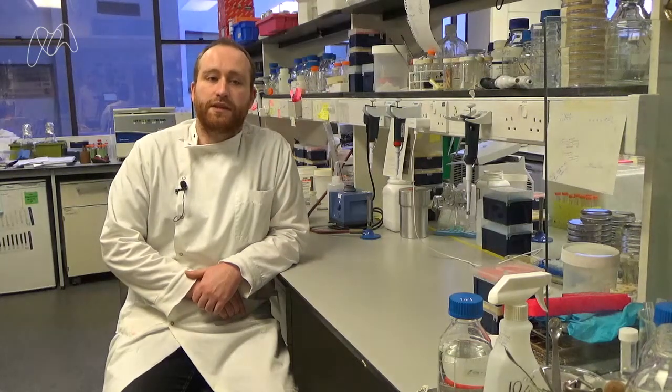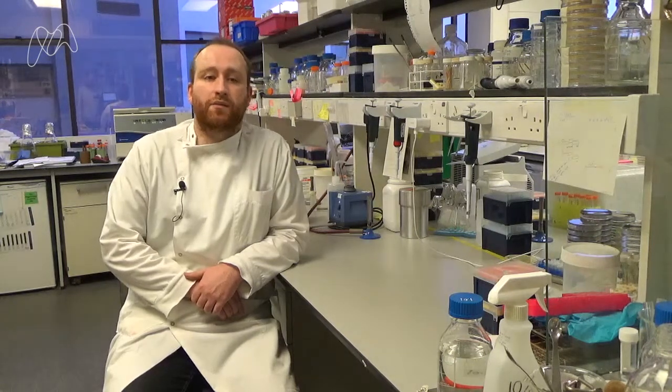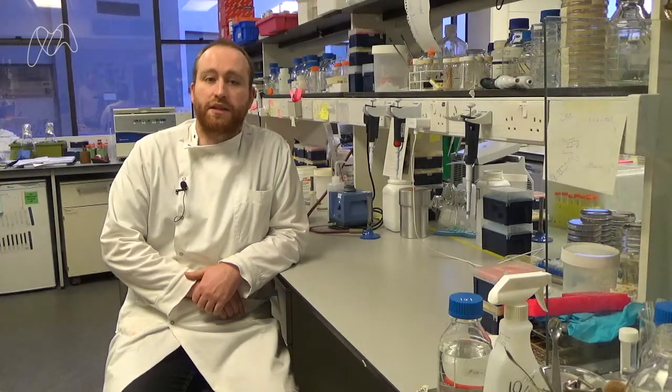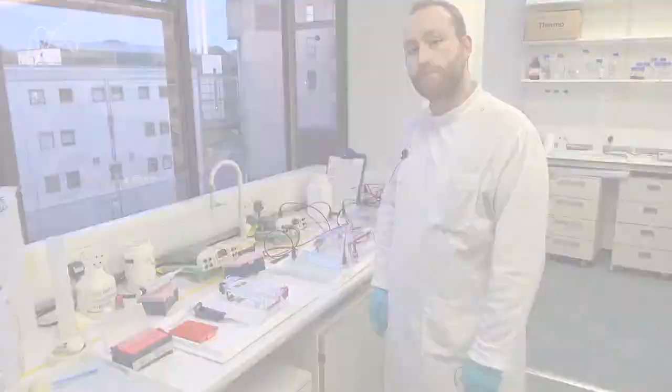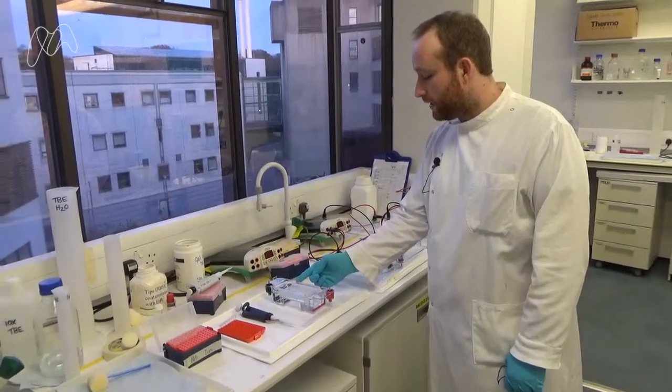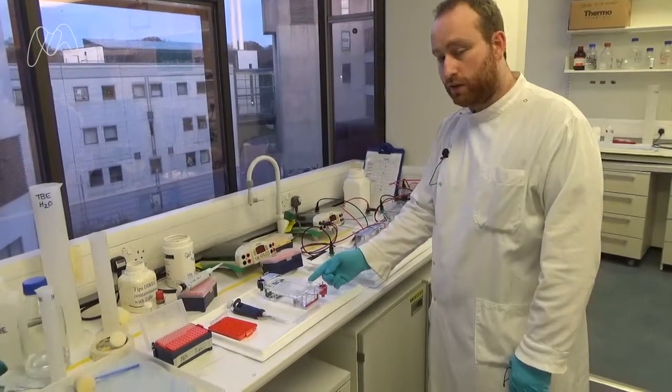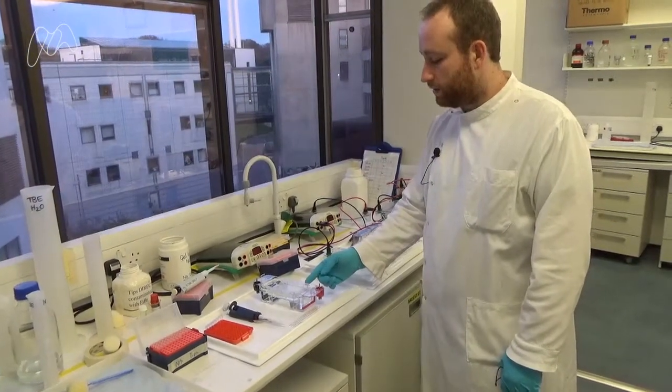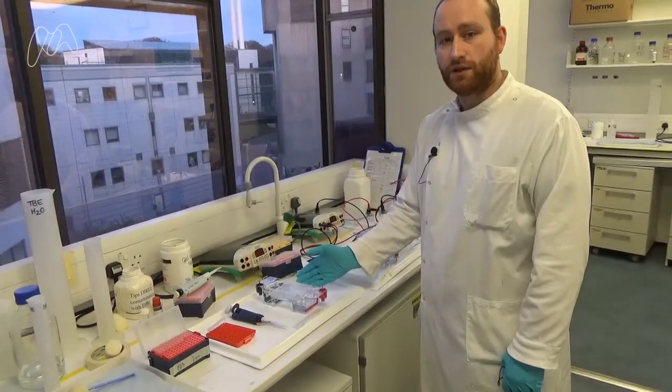To do this, we need to run something called gel electrophoresis. Now this sounds complicated, but the key thing to understanding this process is that as a molecule, DNA has a negative charge. So when we apply an electric current, the DNA will move from the negative electrode to the positive electrode. Smaller pieces of DNA will move faster, so we can separate the DNA based on its size.